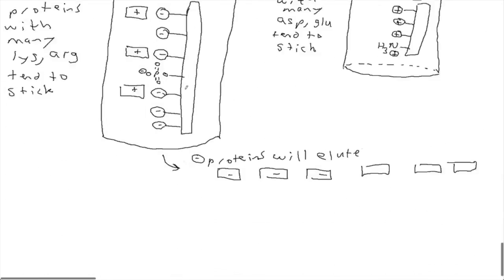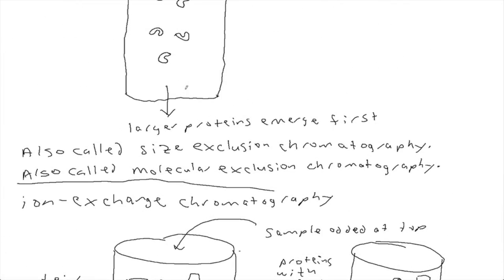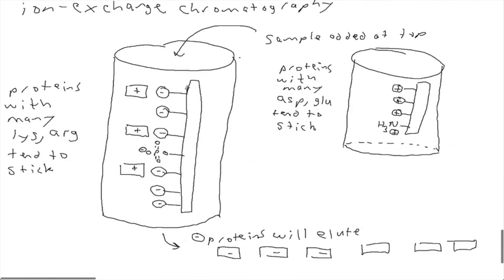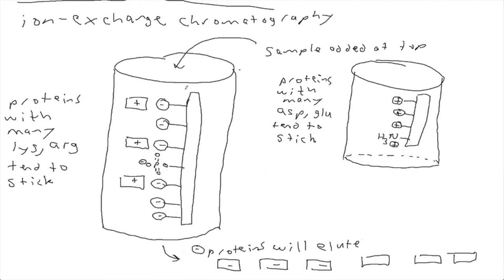So ion exchange chromatography separates on the basis of what? Charge.